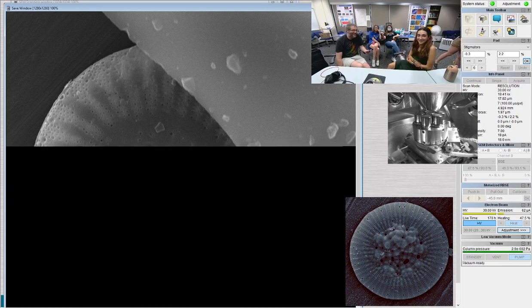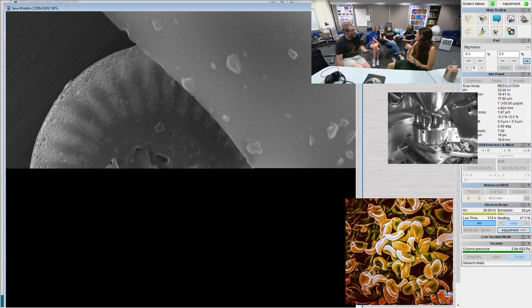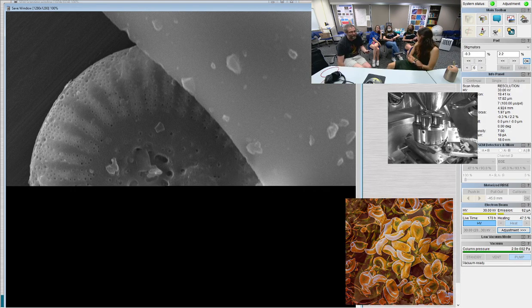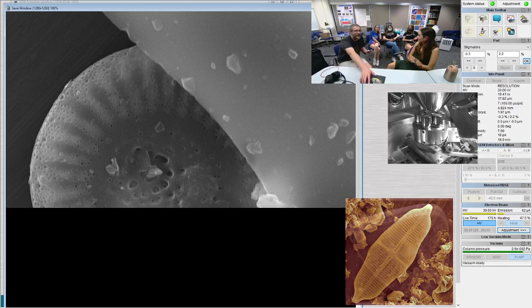Cyclotella. Cycloteloid. What kind? He doesn't know. That's why it's oid. If you add the oid, that means he doesn't know exactly what it is. It looks like a cyclotella, but maybe not. Cyclotella distinguenda. That's why he says naviculoid, and gomphonemoid. He could say gomphonemesque. Yeah, oid means close to, but not quite. The cycloteloid. That's not a cyclotella?